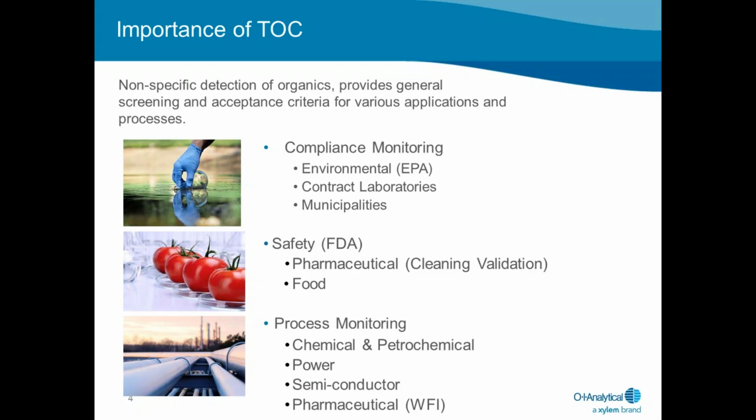It can be used as a general screening tool and indicate if predetermined acceptance criteria are met for a wide variety of applications and processes. The United States Pharmacopoeia, European Pharmacopoeia, and Japanese Pharmacopoeia all mandate TOC analysis as a required test. In emerging markets, such as Southeast Asia and China, these practices are being adopted.